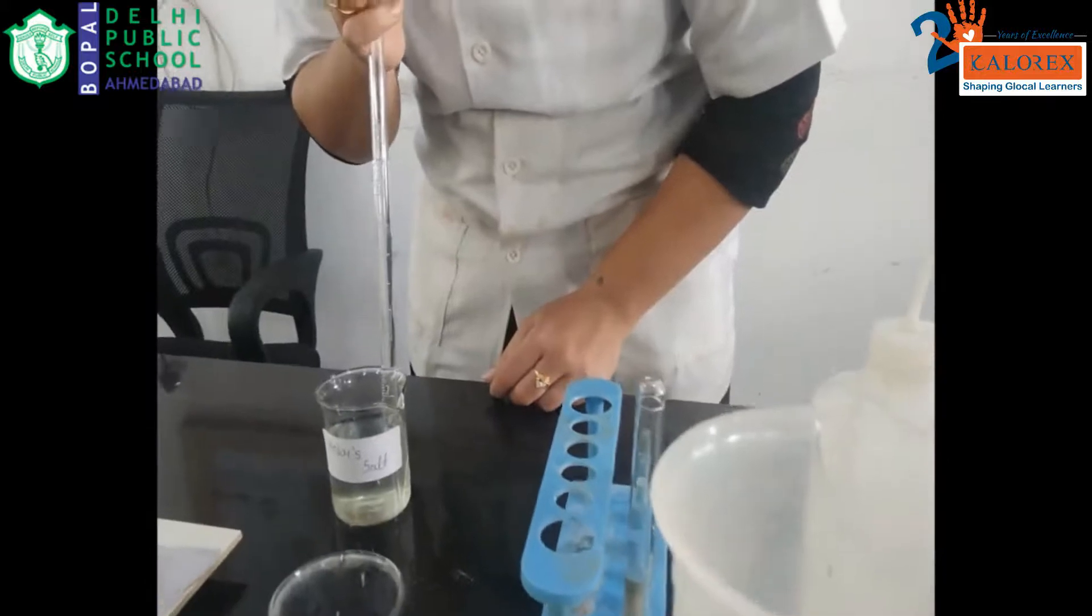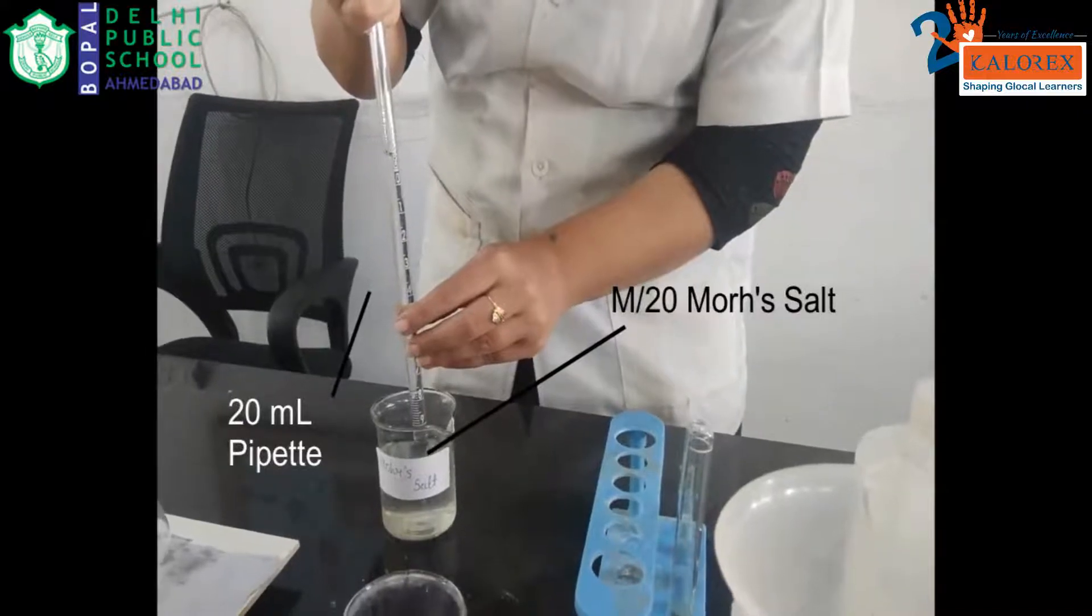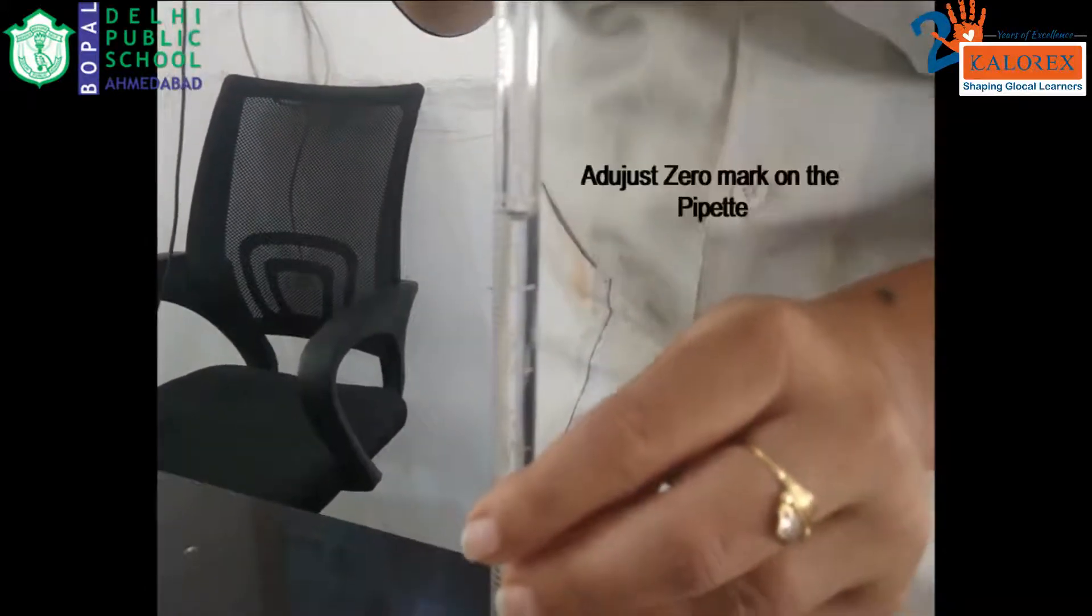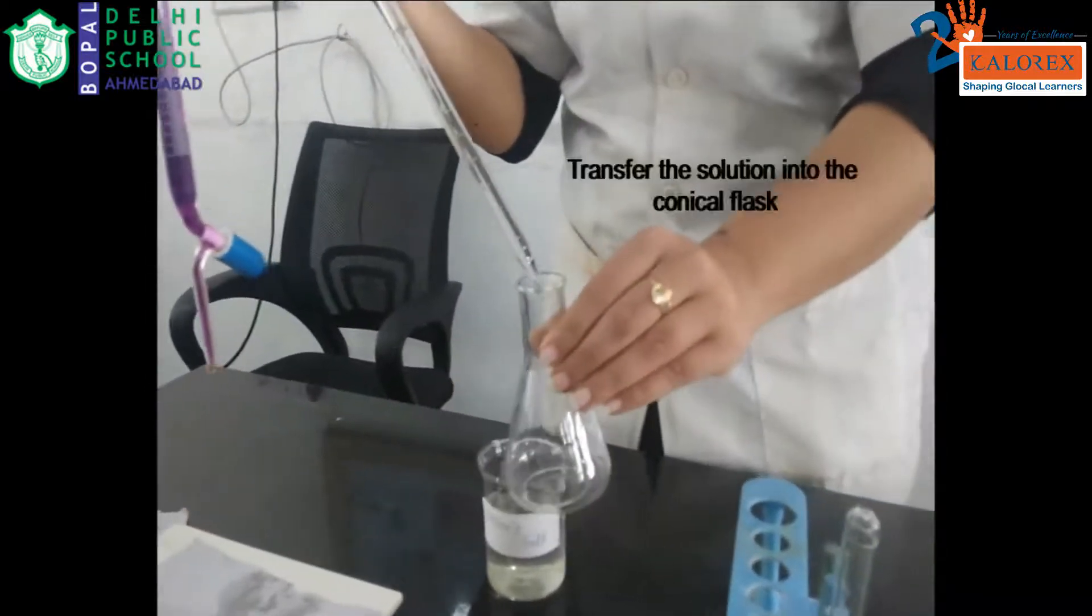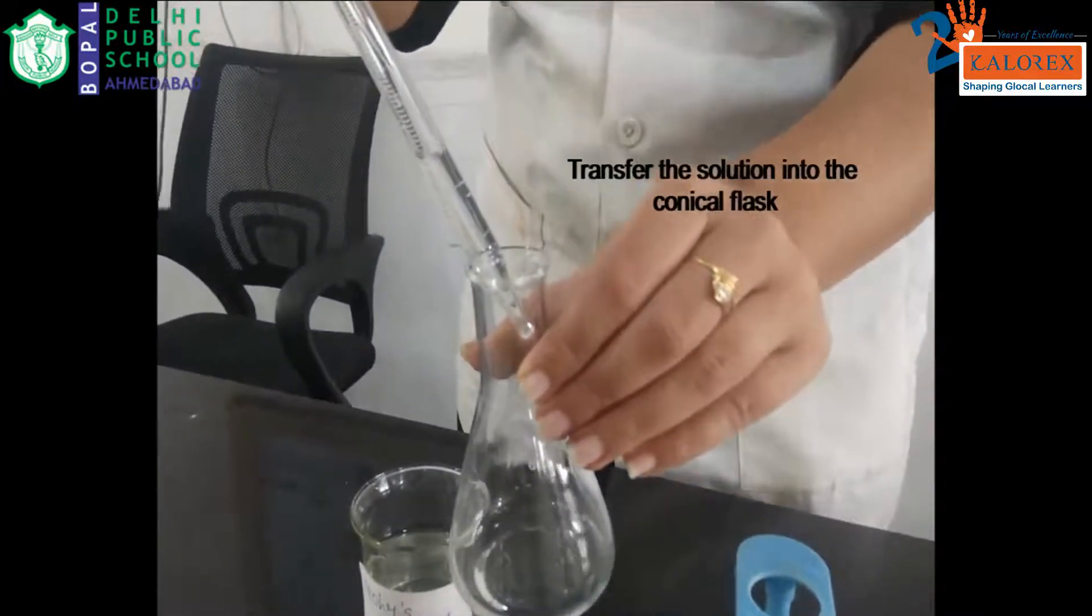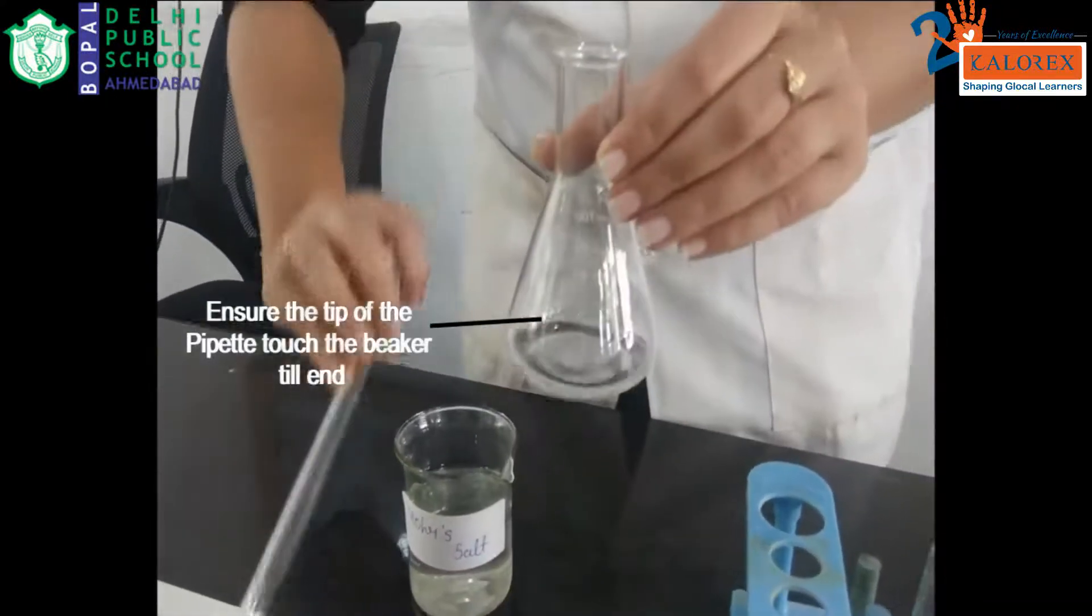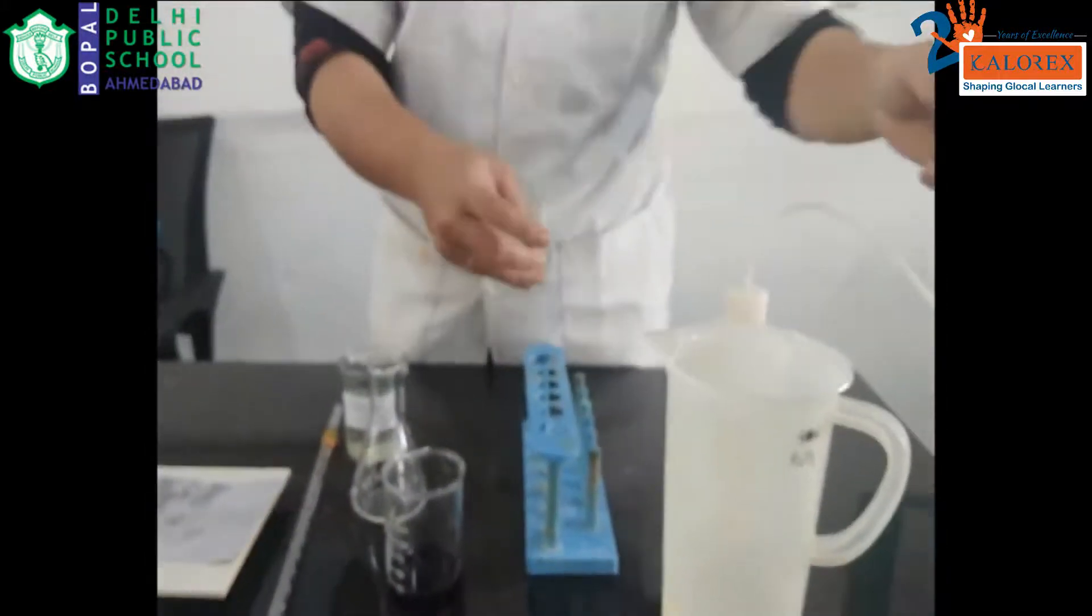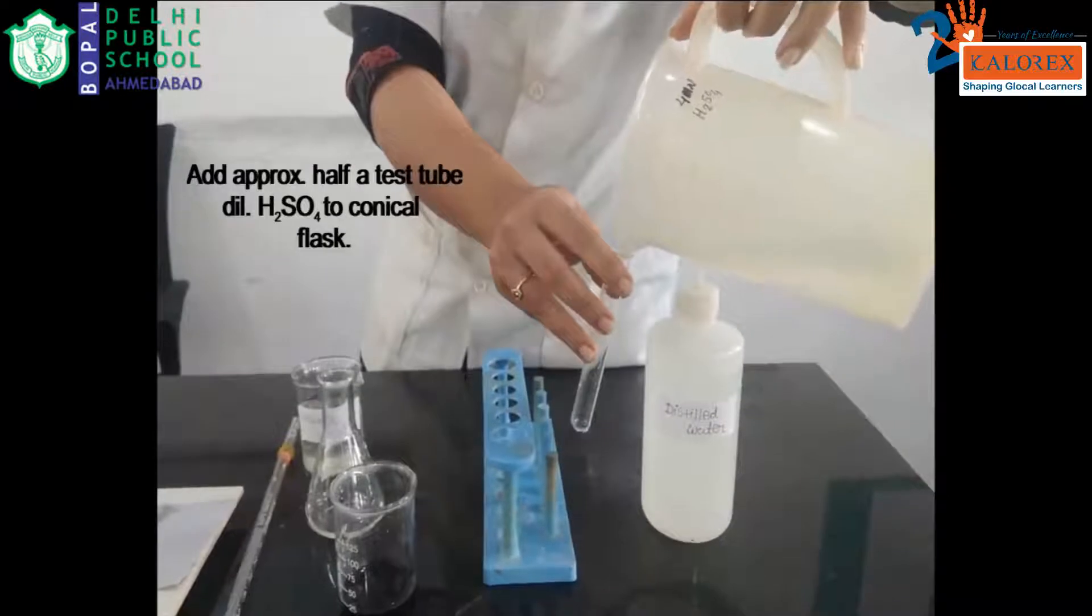Let us start the titration. First of all, use a pipette to take out Mohr salt. The molarity of Mohr salt is M by 20. Using your thumb, adjust the zero mark on the pipette and transfer Mohr salt into the conical flask. Ensure that the tip of the pipette touches the glass of the conical flask. Do not blow out the last drop from the pipette.